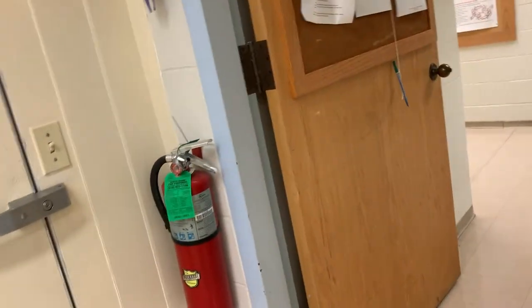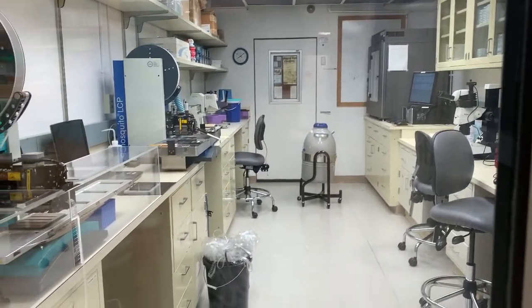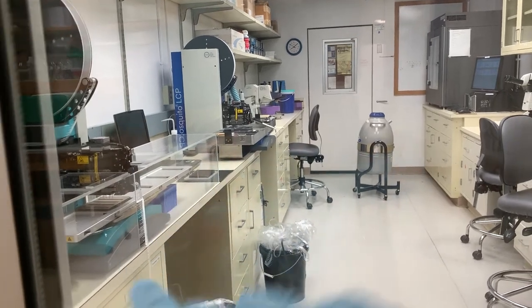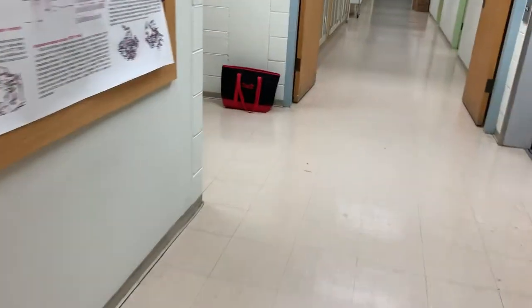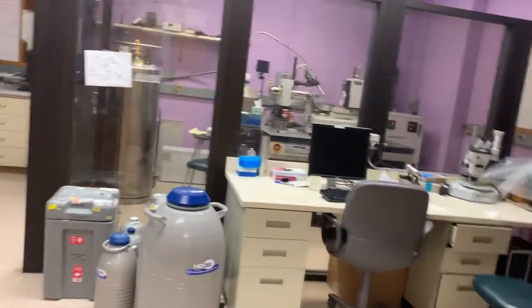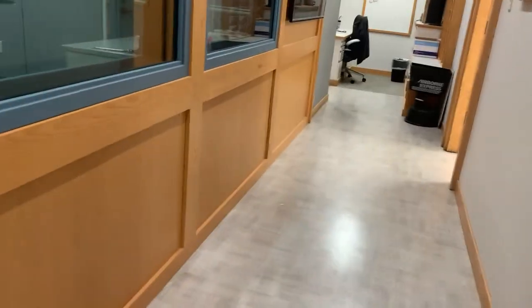We also do crystallography and cryo electron microscopy. This is our crystallography room — we have robots called mosquitoes that help us set up drops, trying out many different conditions to get a protein to crystallize. You take diffraction images by shining X-rays that interact with atoms in the protein, scatter, hit a detector, and are measured — then you work backwards from the diffraction spots. This is our home source, which isn't nearly as powerful as when we go to a synchrotron — a super powerful beamline — when we want to collect high quality data.